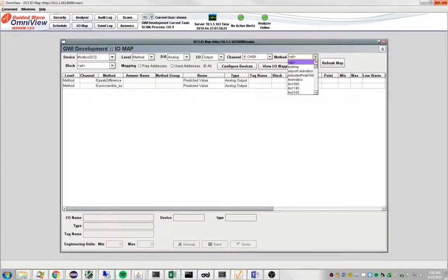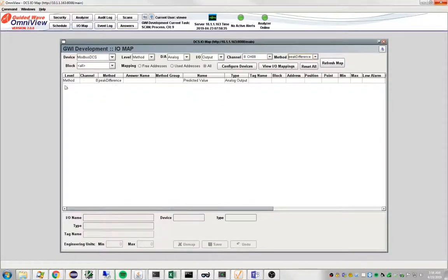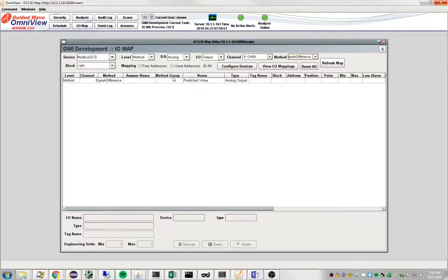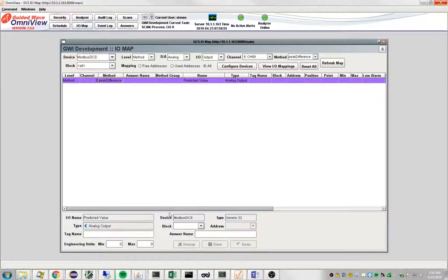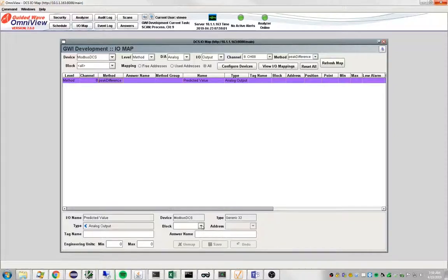You could further restrict ourselves just to that method there. So let's map this predicted value to the Modbus DCS. So you select that row and then down here at the bottom, you have to provide a couple of values.